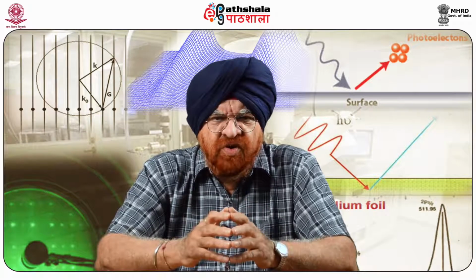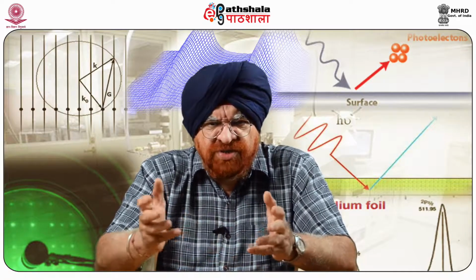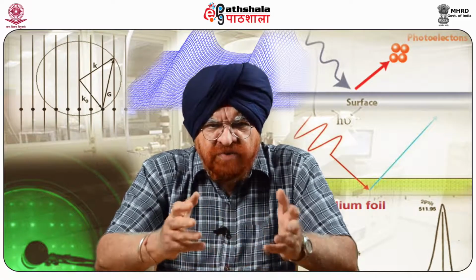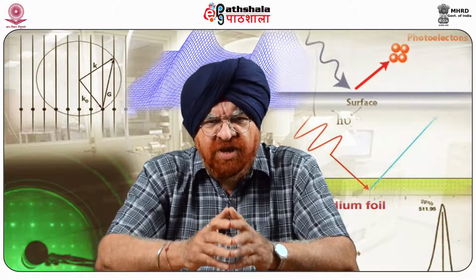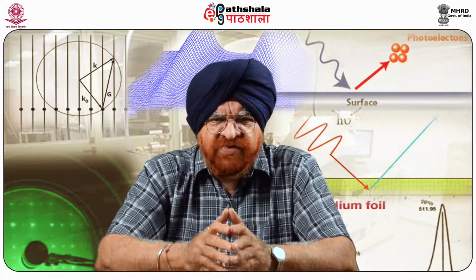Well, typical applications of STMs would relate to electrochemical STM, that is ECSTM, as I said earlier. It is a powerful imaging tool. By now it is very clear that it gives the best possible images, even to the level of a single atom. We can go to the atomic level as well.